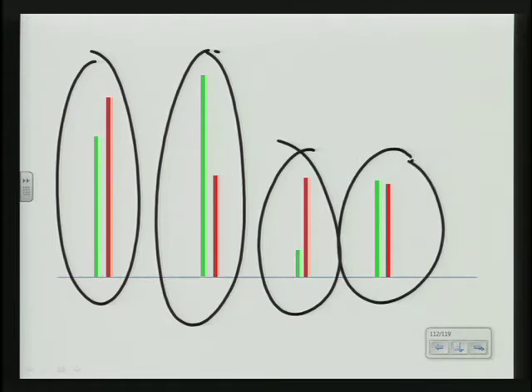And this gets into how DNA gets degraded. We used UV light to do this. It was easy.